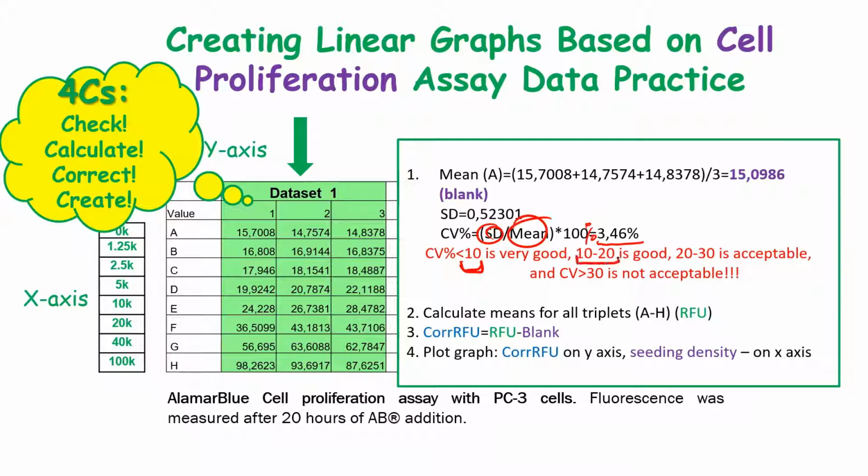If you have 10 to 20%, you should try to find the outlier because this variance might be alarming. For some kinds of research, like drug research, these 10 to 20% might actually lead to lots of complications in the usage of the drug.